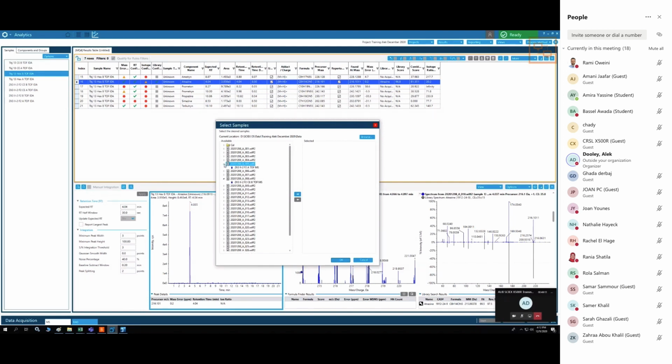But the other ones have the bad retention time. Well, I shouldn't say bad retention time, right? I should say different. Wait, so what happened here? Where are the TBJs? Underneath. Okay, so we'll take one ZK3 and we'll take one TBJ.